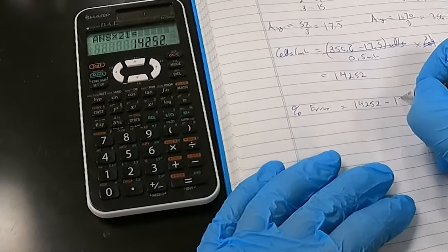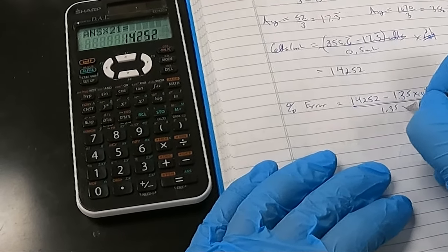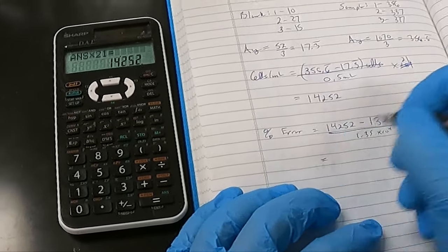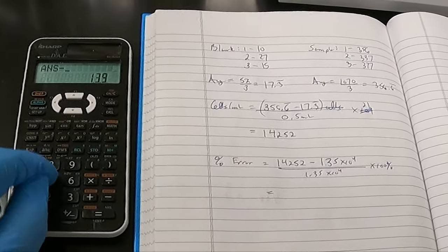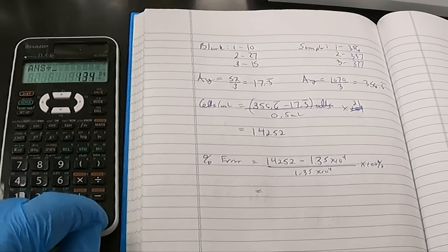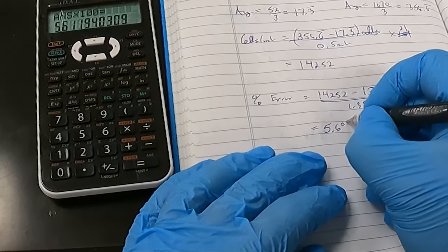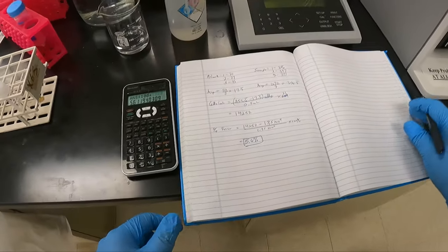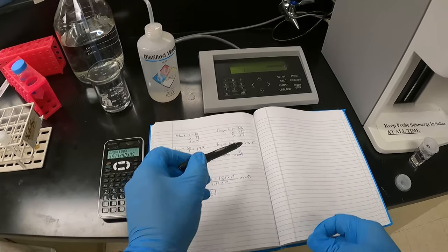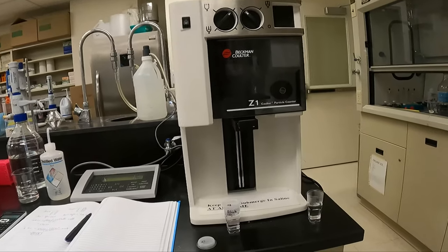1.43 times 10 to the 4 minus 1.35 times 10 to the 4, divided by 1.35 times 10 to the 4, multiplied by 100%, as this is a percentage. Subtract what I wanted, divide by what I wanted, multiply by 100. 5.6%. Well within the 10%. As I said, going below times 10 to the 4 for cell concentration is quite challenging, and I will not be asking you to do that.